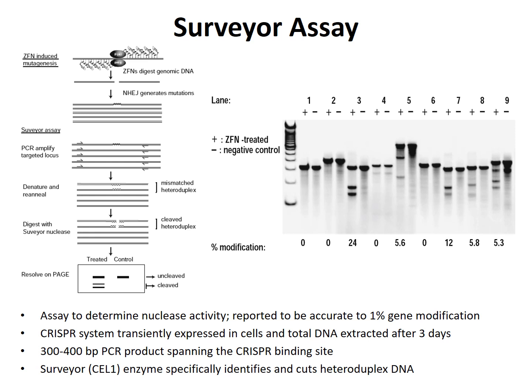Essentially, you transfect your target population of interest with your nuclease, and then you design PCR primers to amplify the region of interest where you're trying to induce double-strand breaks. What this assay measures is the amount of indels, or mutations, that occurred at that site in your population of cells. The trick is you take this PCR product, which will be made up of wild-type alleles, because some of the cells will not have editing, and then some alleles that do have editing, with insertions or deletions.